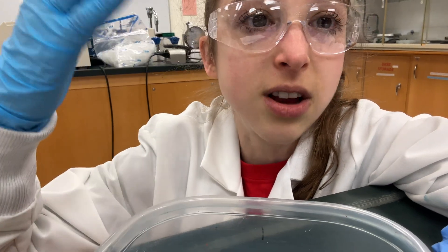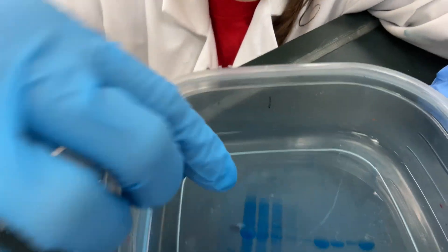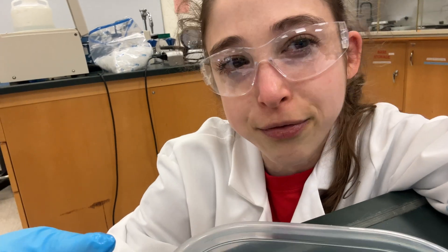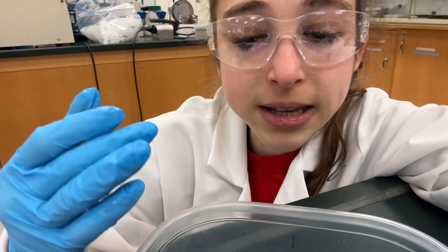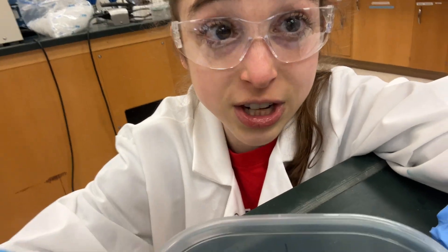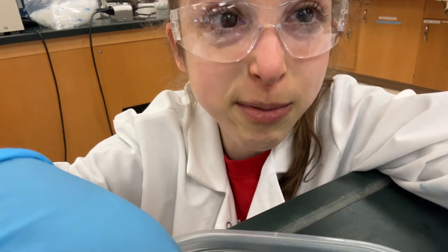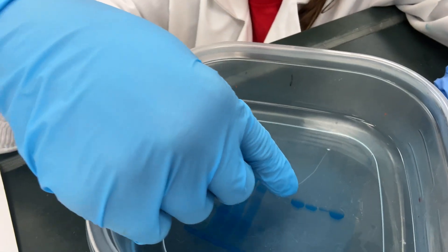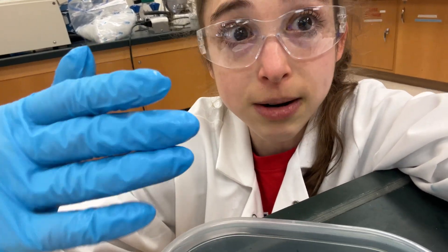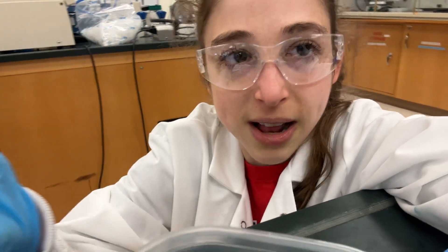In the first lane, that's our supernatant from when we did the expression — we broke the cells open, spun them down, and that's what went on the column. You can see a lot of stuff going in and the flow-through shows some of our protein came through — we probably didn't have enough resin for the amount of protein, but we didn't know it was going to express like such a beast. Then you see the washes, and in the last wash before imidazole you can see we got rid of most of the extra stuff. Starting the imidazole, around 50 to 100 mM imidazole our protein started coming out.